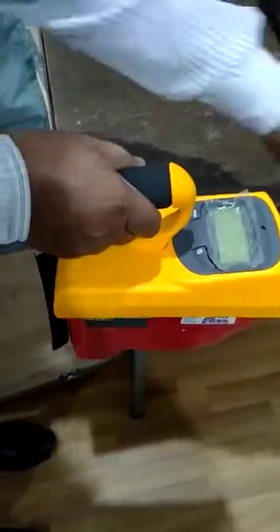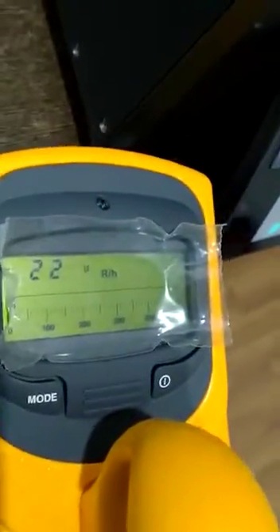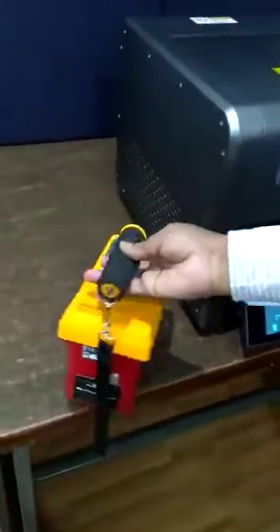Radiation leakage test by survey meter from front side. Back side. Left side. And right side with 5 centimeter distance.